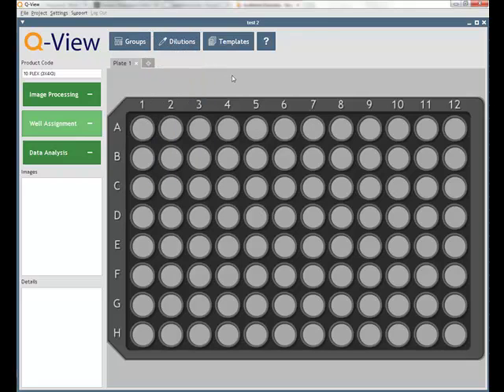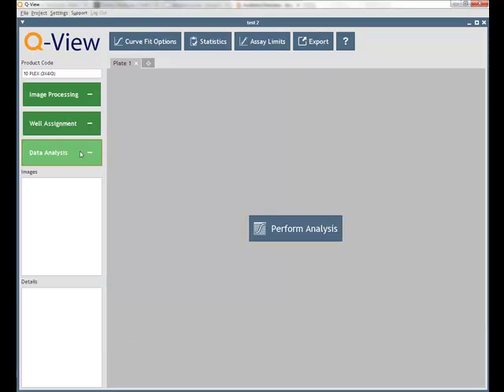During data analysis, users can customize and export generated concentrations, statistics, and charts. QView stores the images and analyses of related plates together in a single folder called a project that has a .QView extension. As you work, changes to these projects are saved automatically.